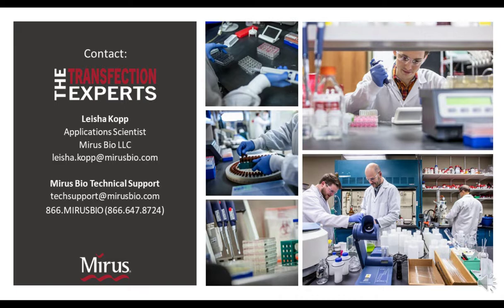For the next question, it looks like, what transfection complex formation time do you require in a large-scale process? And the majority of people cited 30 to 60 minutes. So I think that's a great thing to see. No one actually noted greater than 60 minutes. So based on our results, the Virusgen formulation and complex window should be sufficient for most, which is great.